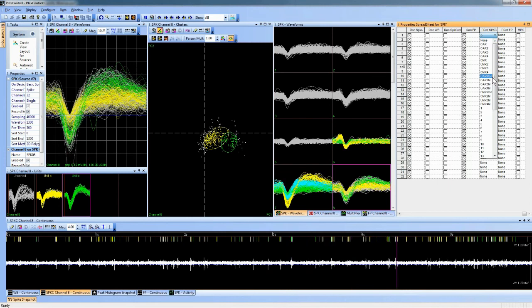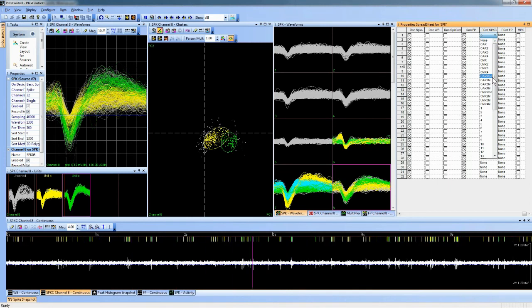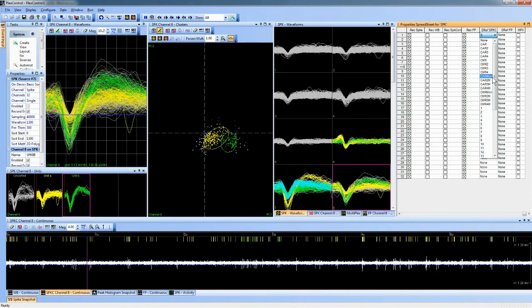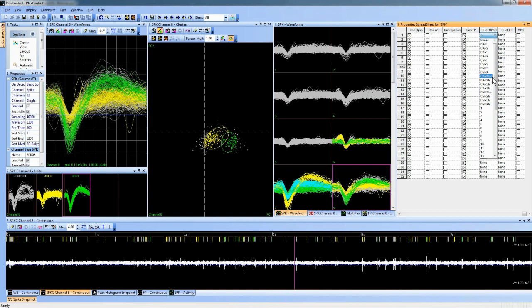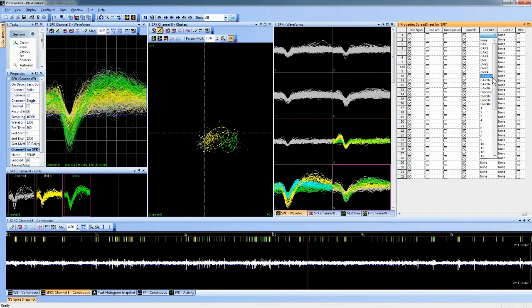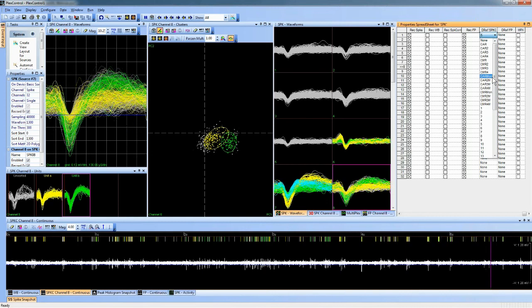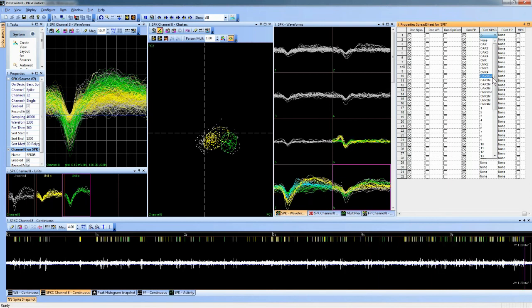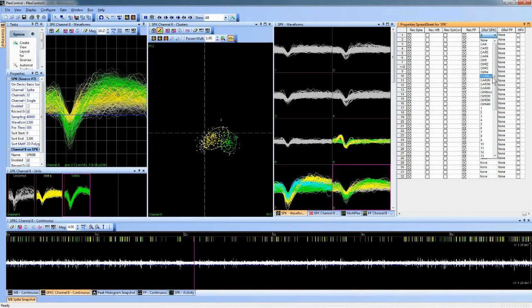So it's a way of monitoring what's being used as the reference. This is very useful, as it can be tricky with CAR or CMR because it's not exactly easy to figure out what exactly is being used as the reference. Yes, we know it's the average, or we know it's the median, but what exactly does that look like? Without a monitor channel, we're not able to tell. So we can visualize that online and just keep an eye on the average that's being used for those channels.